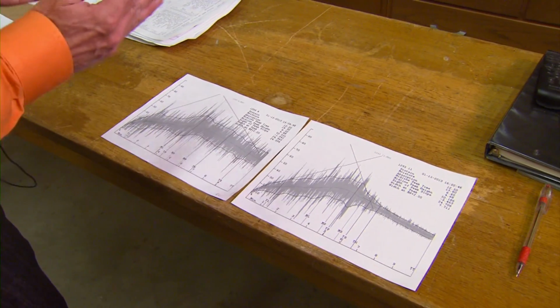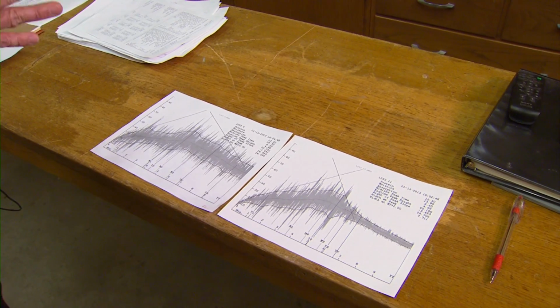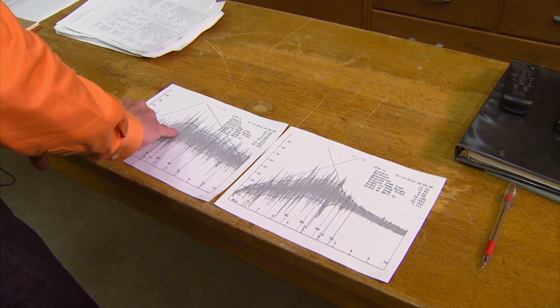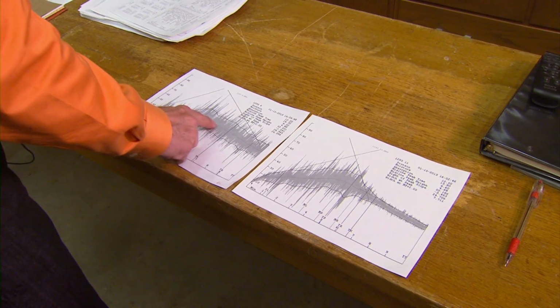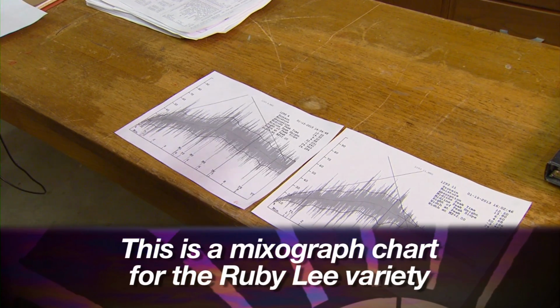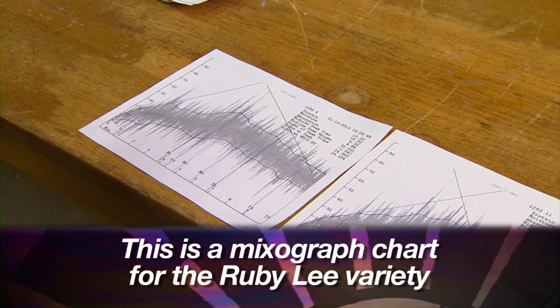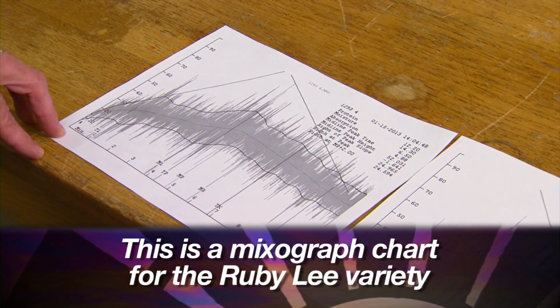However, a very short mixing time, where this part of the graph would be shorter, generally tends to tell us we have a weak dough. So strength is not there. Okay, now look at the other part of the curve, the descending part. This is where the dough continues to be mixed beyond its peak development. So we're over-mixing it. We're applying more energy than it really needs. So we're looking at the strength of the dough relative to over-mixing.